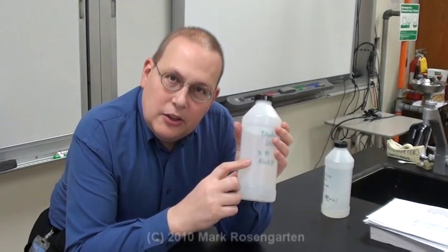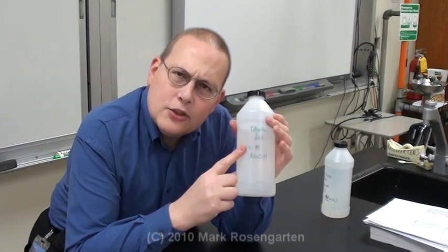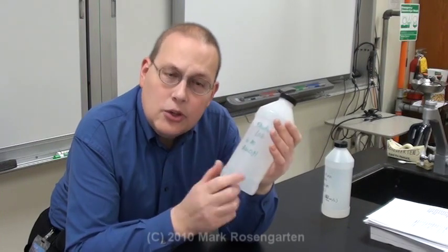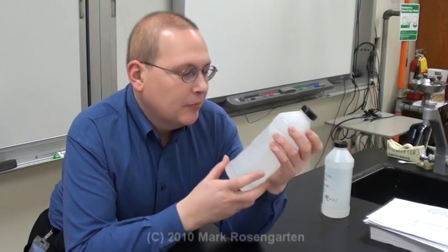When you run an experiment you need to know what the concentration of your solution is. So you need to figure out a way to determine what the concentration of this NaOH is. Unfortunately it's NaOH which makes it a base. So how do you figure out the concentration of the base?